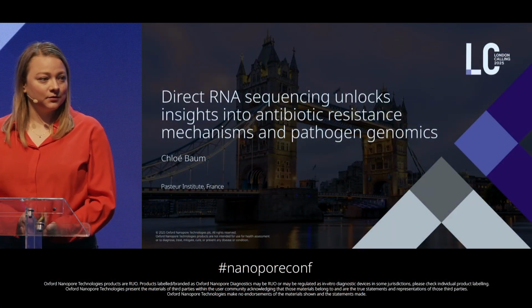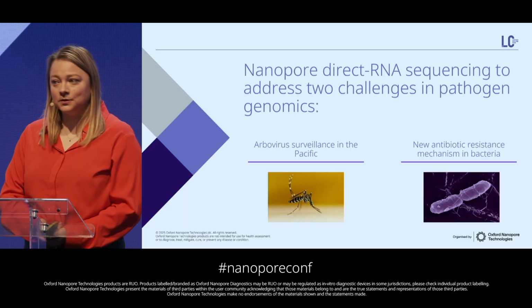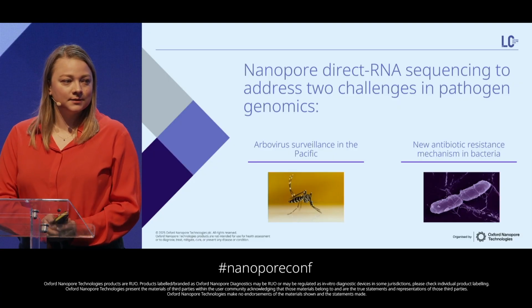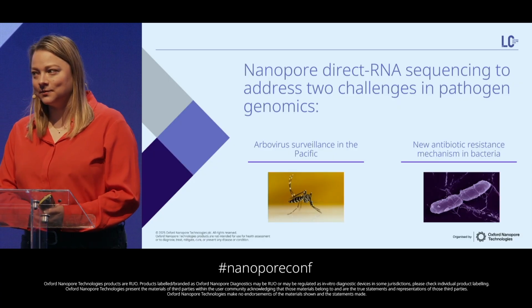And today I'd like to share how we use nanopore direct RNA sequencing to address two challenges in pathogen genomics. So the first one will be on arbovirus surveillance, and the second one will be on uncovering a new antibiotic resistance mechanism in bacteria.